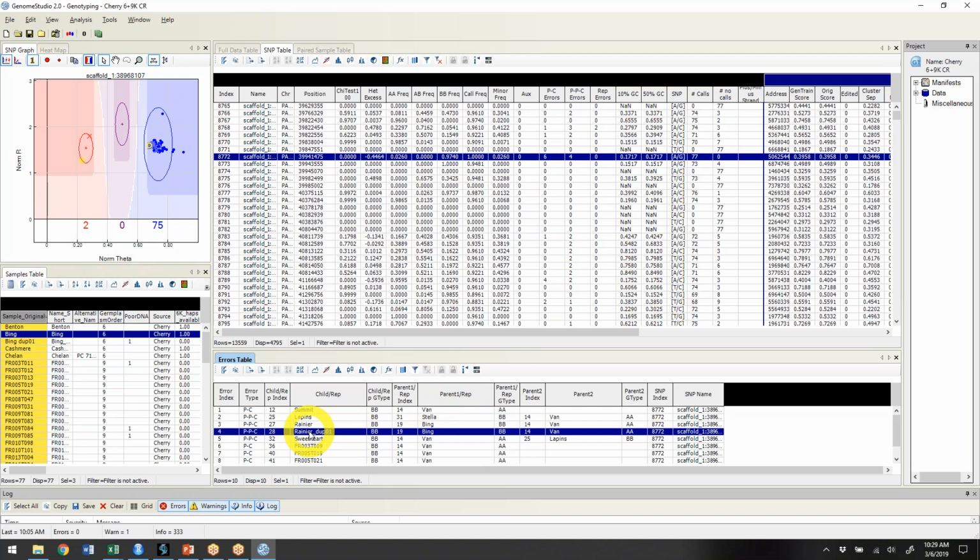Before next session, I will share that new sample sheet file, so if everybody can use that one, so they have the parent-child relationships in there, and then create a new GenomeStudio project with that sample sheet, and just make sure that everything works for you in GenomeStudio. That would be great. Other than that, I think I talked about everything I wanted to talk about today.